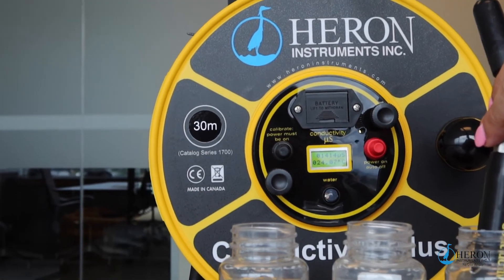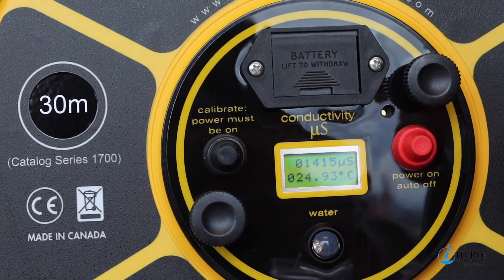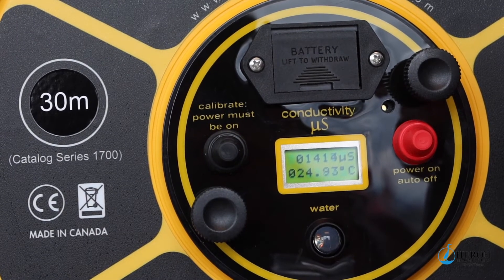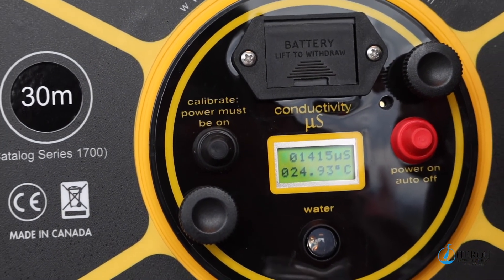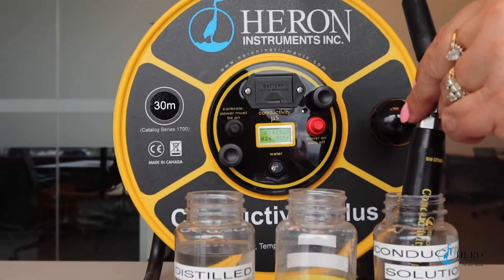Note: 1413 microsiemens will show plus or minus 2%, which is a successful calibration. If the number shown on the panel is not within 2% of 1413, this is not a successful calibration and the meter probe could be damaged. Clean the probe again thoroughly and recalibrate.